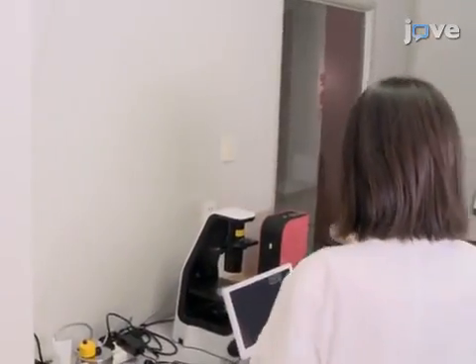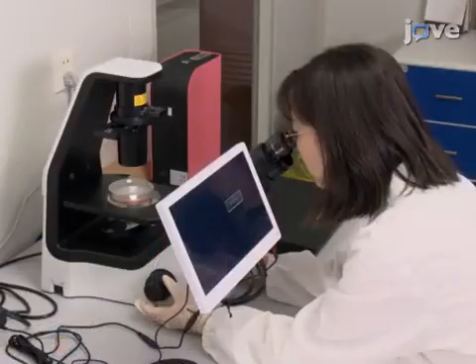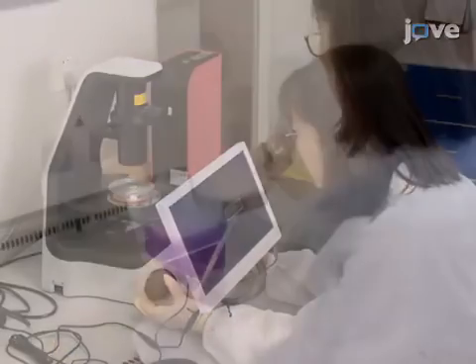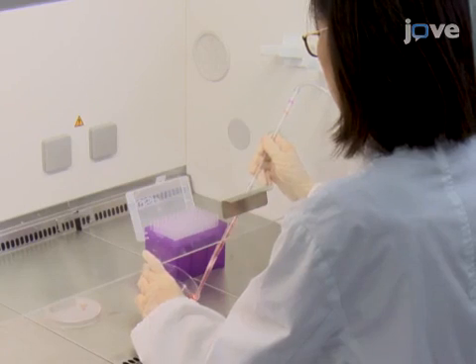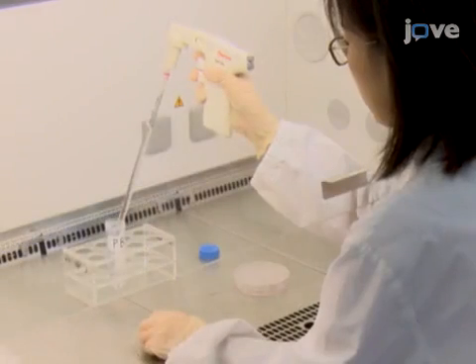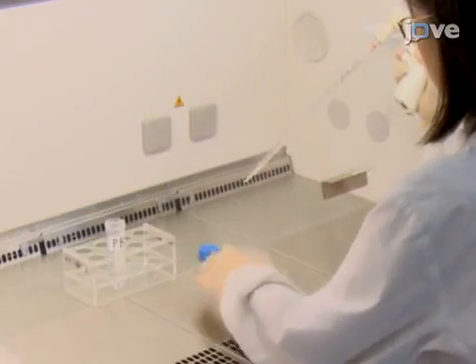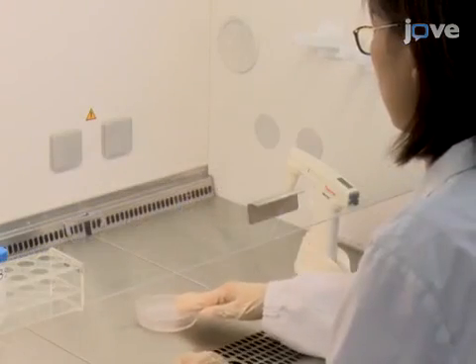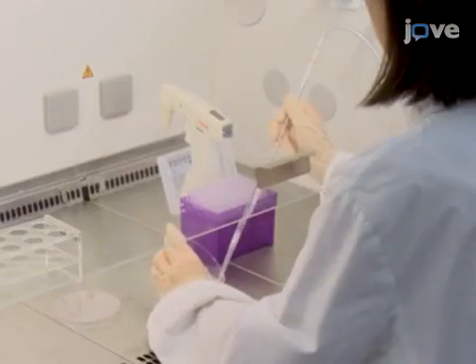Begin by observing HANA-3A cells under a phase-contrast microscope to ensure cell viability and to estimate confluence. Then aspirate all medium from the cell culture dish and wash the cells by adding 10 milliliters of phosphate-buffered saline onto the plate, swirling the dish, and aspirating the PBS.